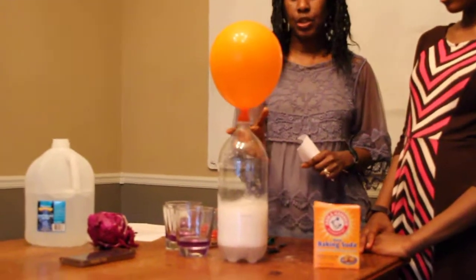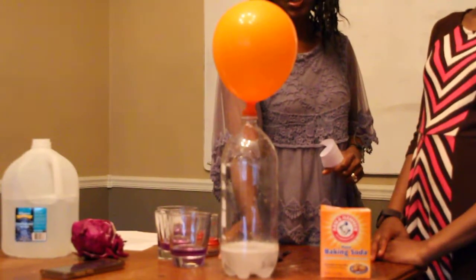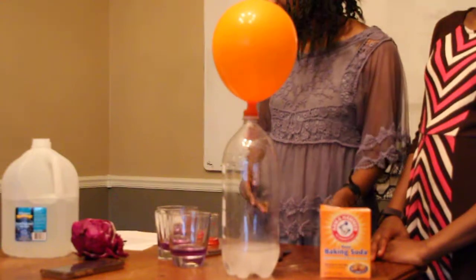So there is a reaction, and it's no surprise to you that this reaction of baking soda with vinegar, which is like acetic acid, is going to produce a gas. And that gas is carbon dioxide.